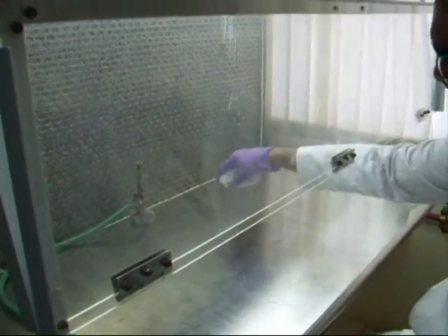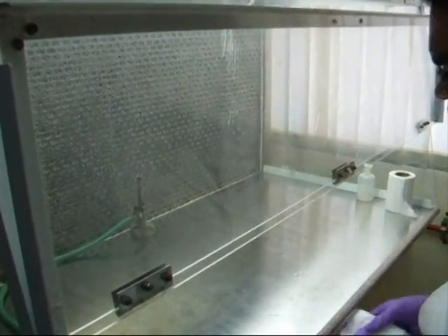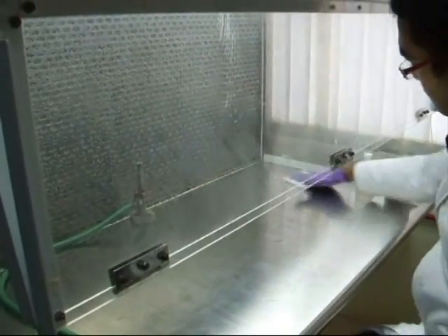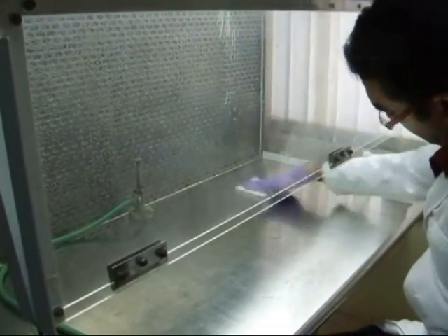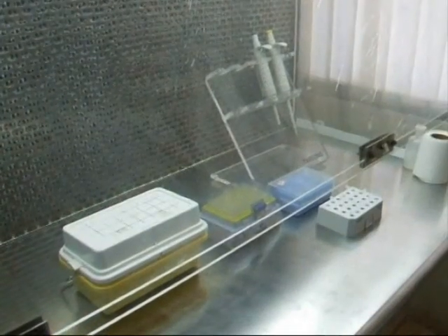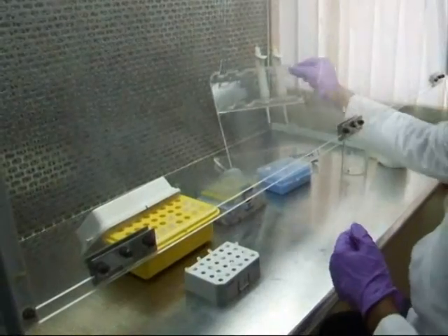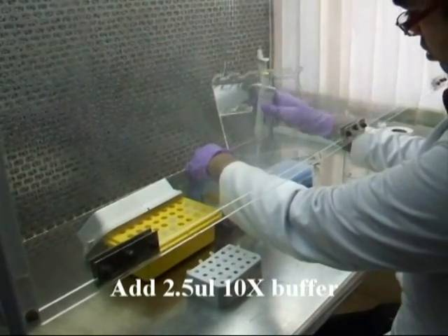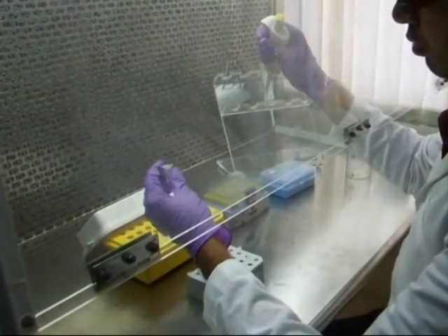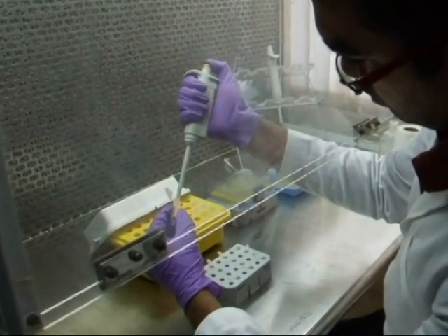Wipe the laminar air flow using 70% ethanol. Place the accessories as shown. Now, add 2.5 microliter of 10x buffer. Buffer is added to maintain the pH.